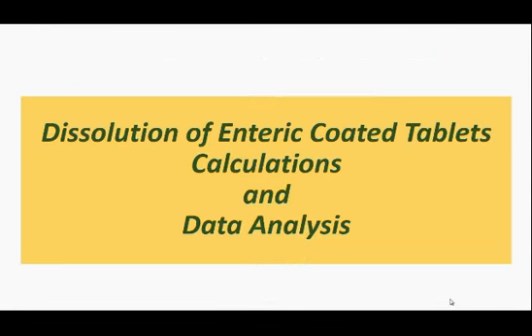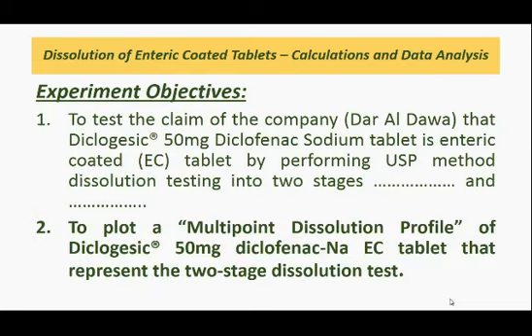Hi, this is the solution of the enteric coated tablets experiment, calculations and data analysis. As you remember, our objectives were to test the claim of the company Dar Al Dawa that Diclogesic 50 mg tablet, diclofenac sodium tablet, is an enteric coated tablet by performing USP dissolution method testing in two stages, the SGF and the SIF.